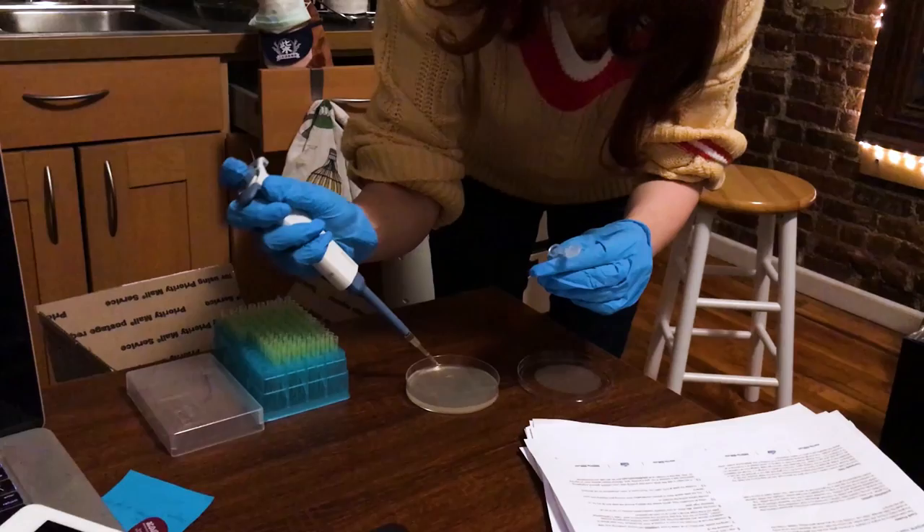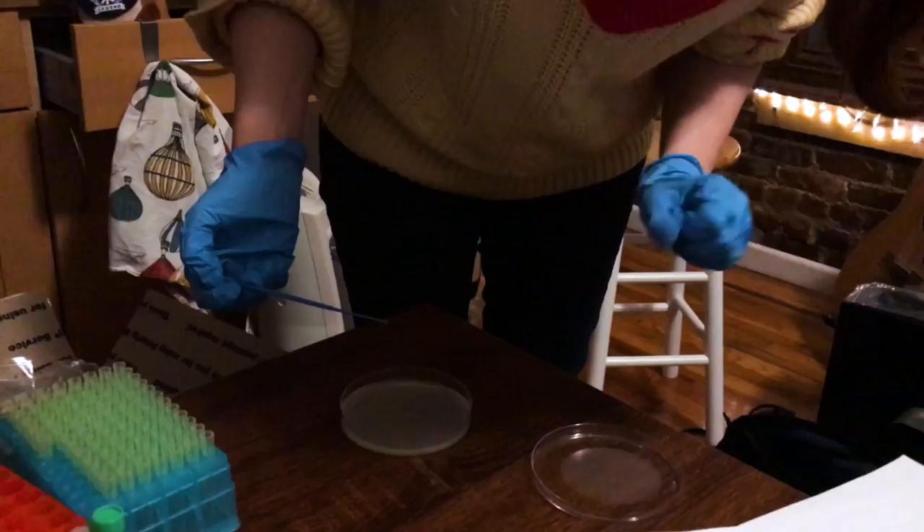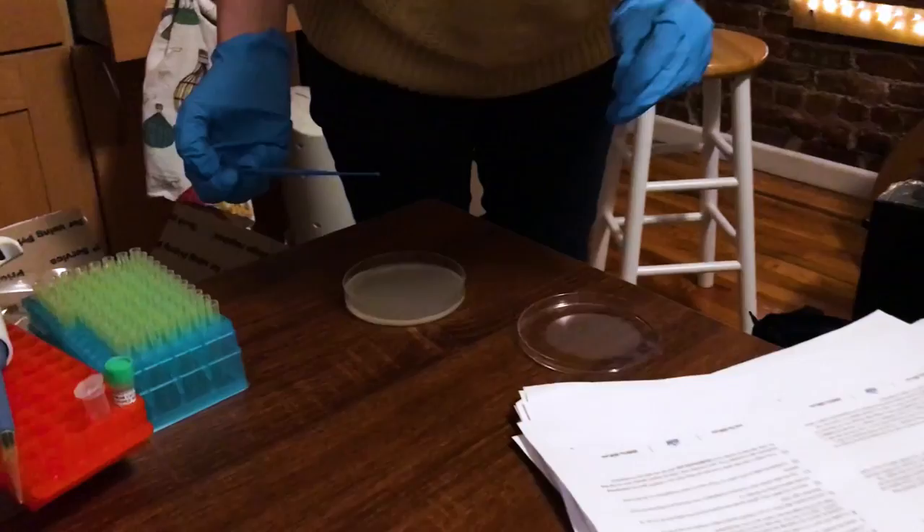We're going to let this sit for four hours, then we'll pour it onto our strep solution. After spreading the solution on our new plates, all that was left to do was wait — put the lid back on and leave it for 24 to 48 hours.